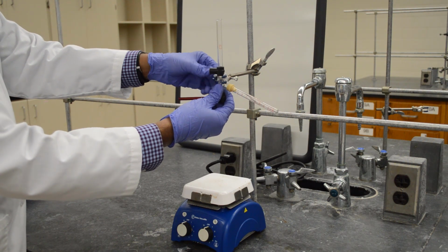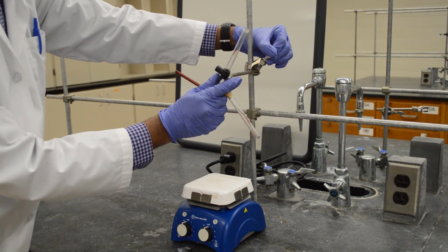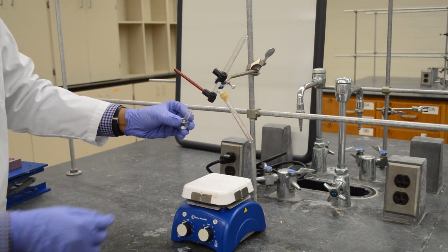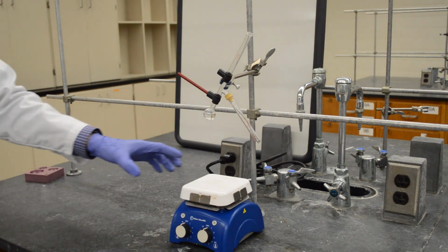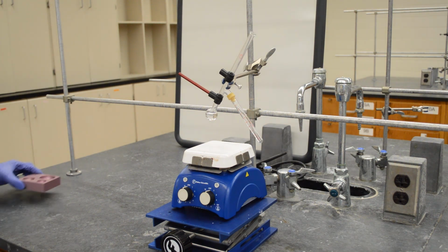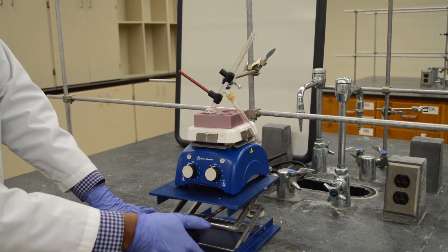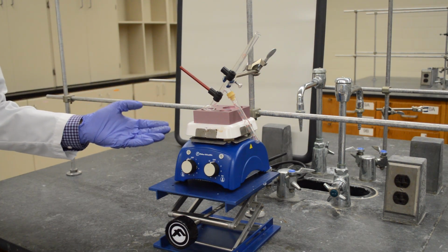Clamp your apparatus, tilt it to a 45-degree angle, connect your round bottom flask, put the hot plate on a jack, place an aluminum heating block, and raise your hot plate to the round bottom flask. Okay, that's a complete setup for a reaction.